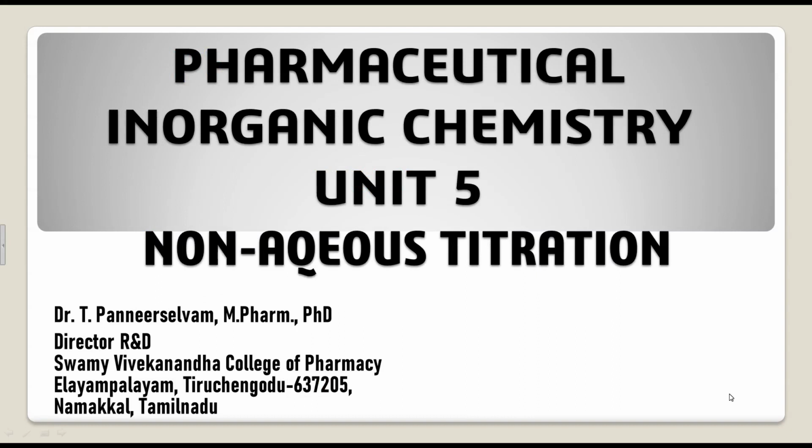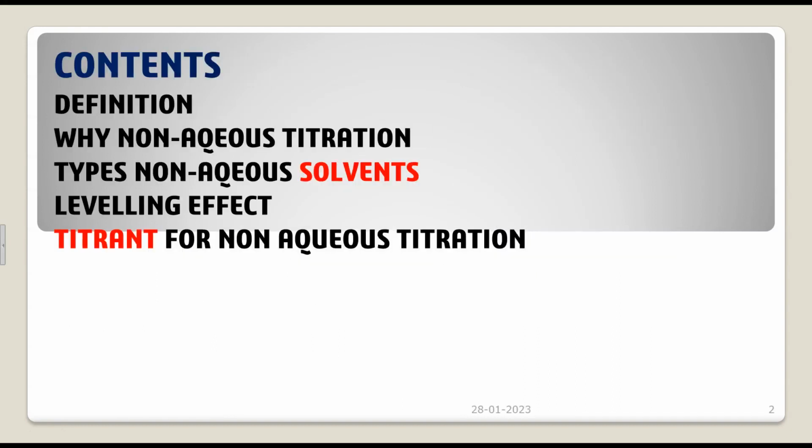In this video, we are going to see about pharmaceutical inorganic chemistry unit 5, that is non-aqueous titration. Under this unit, we are going to cover the following contents: the definition of non-aqueous titration, why non-aqueous titration is important, then types of non-aqueous solvents, then what do you mean by leveling effect, and finally, what are the titrants available for non-aqueous titration.